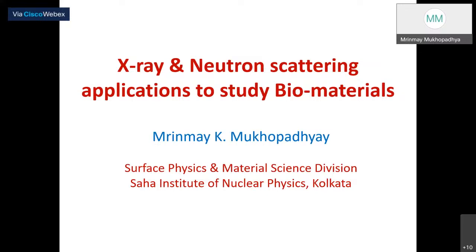So that is my point. I'll try to explain those things, and then I'll show you some applications where you can see how these X-ray and neutron scattering techniques are used to understand biomaterials or biomembranes. So let us continue from that with some recap.